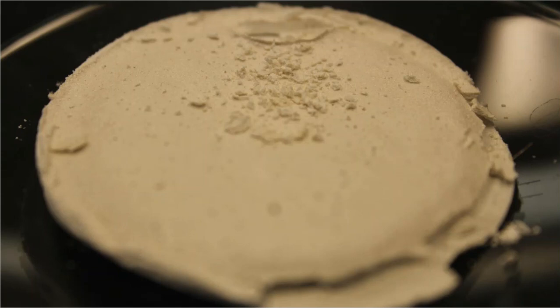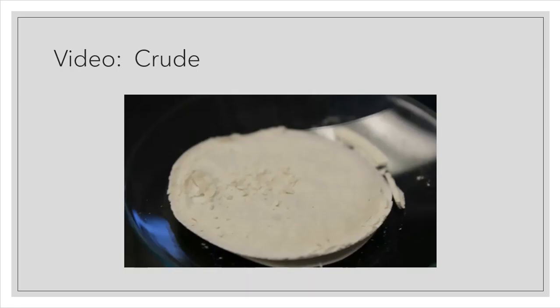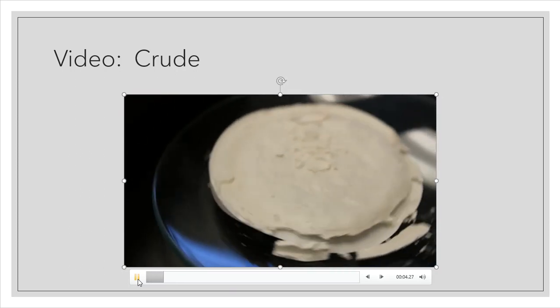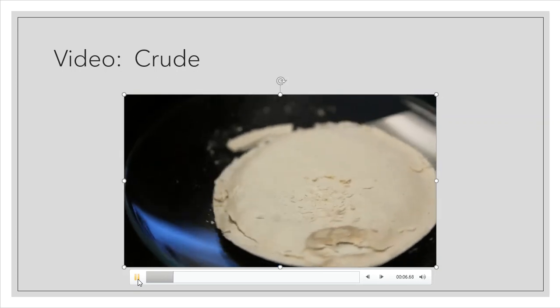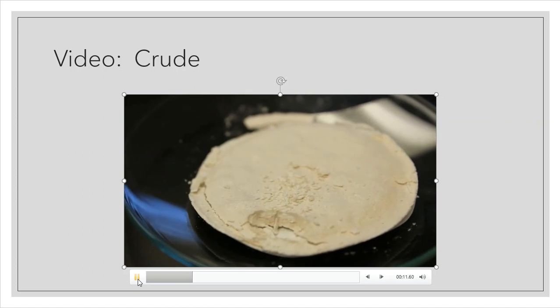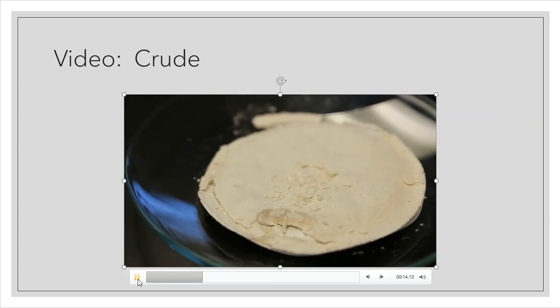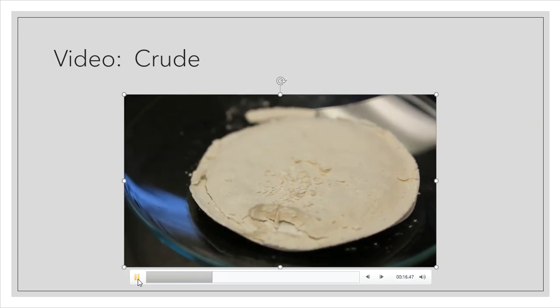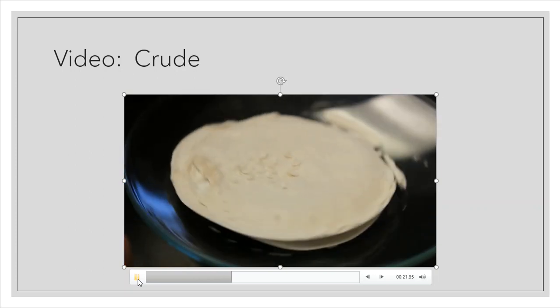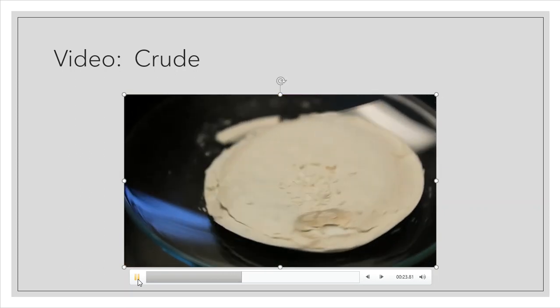Again, you can make your observations. And then I also have a video that I would like to share with you in live motion of those products. What you're seeing in this video right now is not the final product, this is the crude product of the transcinnamic acid addition. So this was transcinnamic acid, I added bromine to that double bond, broke the double bond, put a bromine on each of those carbons involved in the double bond, and this is what the product looks like after I get it out of the oven.